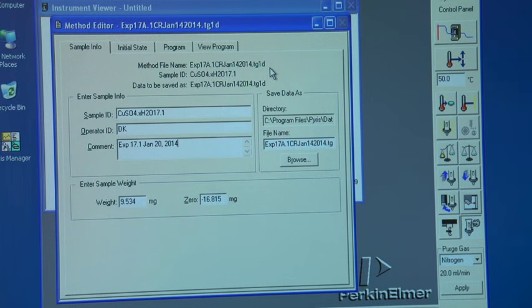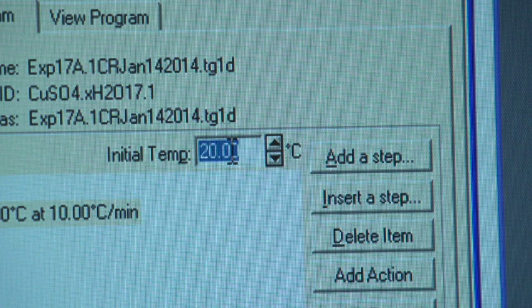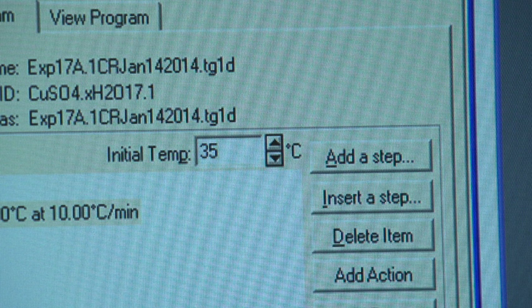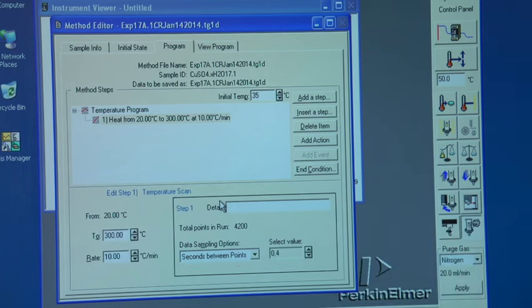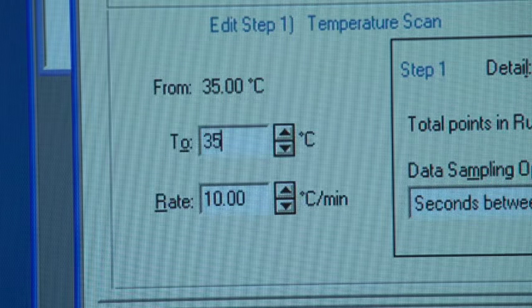The next step is to fill out the temperature program for the experiment. Click on the Program tab. Enter 35 degrees Celsius as the initial temperature. The final temperature for this experiment is 350 degrees Celsius. Put this temperature in the blank after 2.